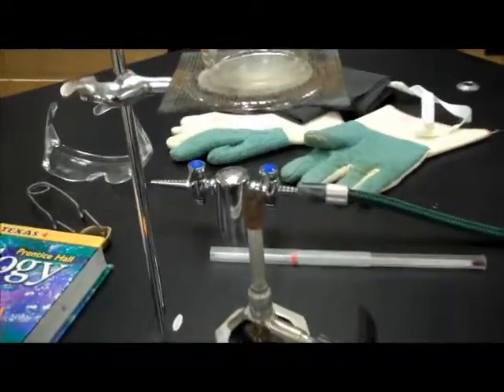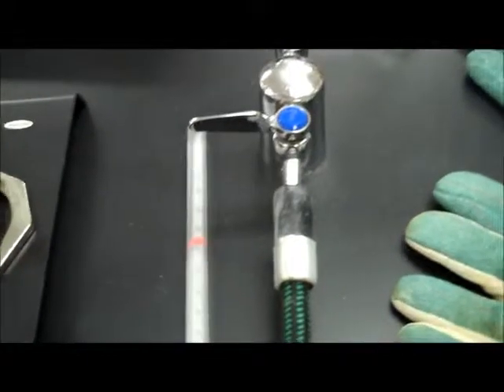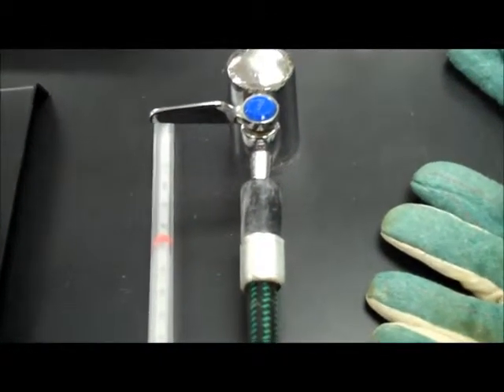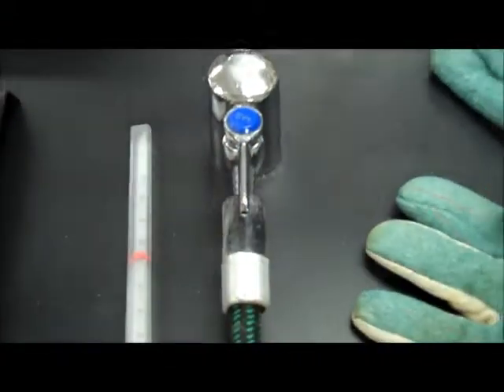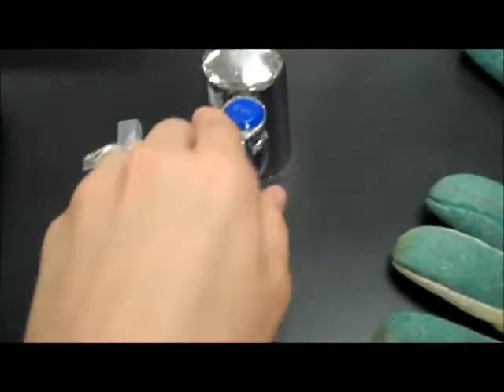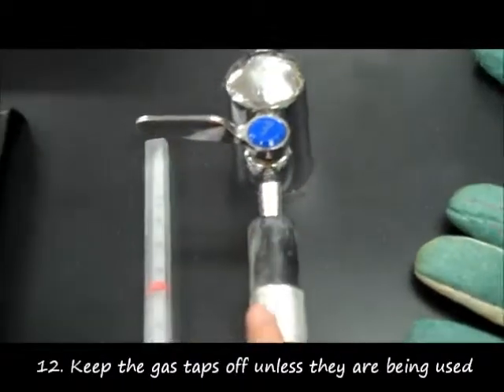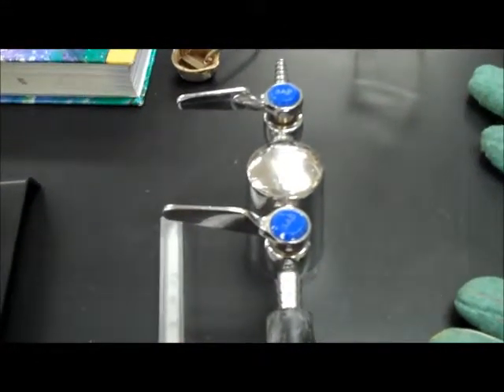Now, looking at the gas taps, when you're dealing with a Bunsen burner, you're going to need to turn the gas on. When you need to turn the gas on, you'll turn the handle of the gas tap to where it is parallel with the spigot. Because it's parallel, it's now on, and you can light the Bunsen burner. If you need to turn it off, you should turn it so that it's perpendicular to the spigot. That means that it is off. This is the position that all of the gas taps should be in whenever we're not using them in class.